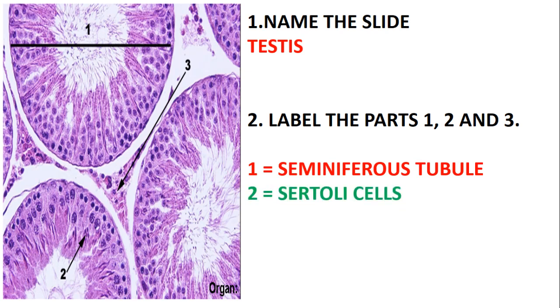Part two is just the Sertoli cells. If you look at those cells there, these are just the Sertoli cells. I'll explain their functions in the tutorial video I'm going to post soon. Part three is just the Leydig cells. So we have identified this slide as a testis: one — seminiferous tubule, two — Sertoli cell, three — Leydig cell.